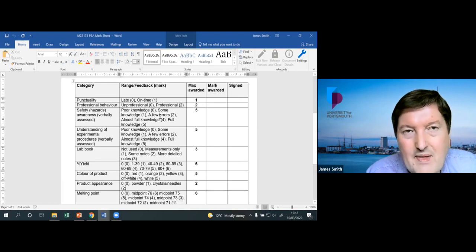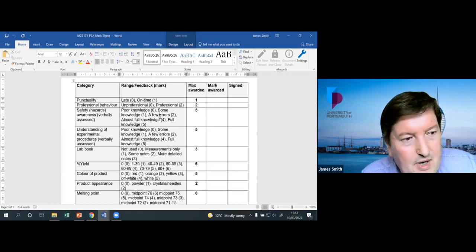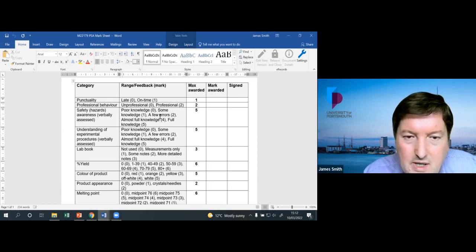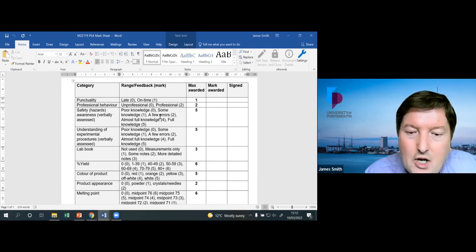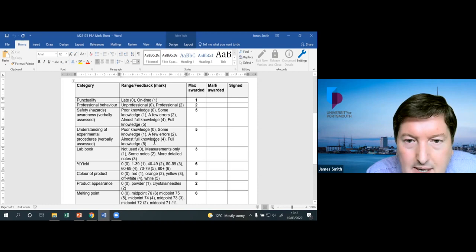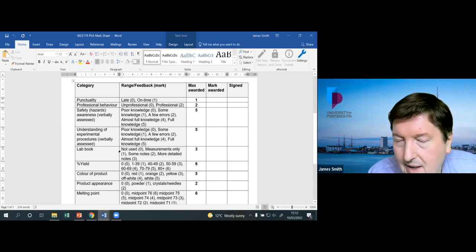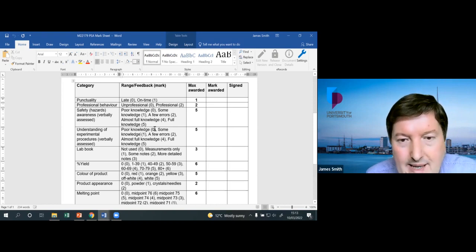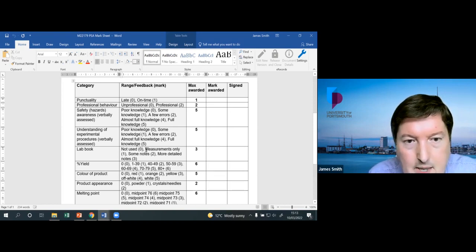Yeah. So when I say the level of detail, I'm not talking about, sentence by sentence, it has this particular risk phrase and not that level, but you certainly don't want to be saying something is toxic when you mean corrosive, so make sure you know exactly what. Something might be toxic and corrosive, so you need to know that. So a little bit more detail about the chemicals involved. There'll be other things about slip hazards and gloves and why you're wearing certain things. And so there'll be that level too, but down to the chemical level, you need to know a bit of knowledge there.